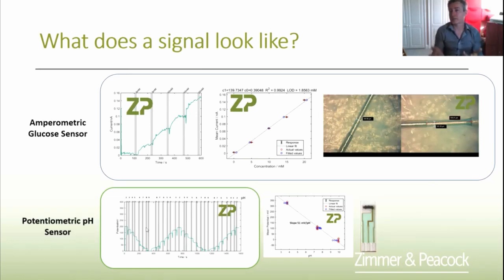So you've got to buffer this system. Otherwise, you can have an enzyme in some sort of unknown pH between 5 and 7. And if that's going on, then you'll have a different signal due to the pH, and it's not specific to the glucose. So we buffer because often pH can be a source of variation in an assay. We don't want that source of variation. So we buffer it to make sure that pH is not a variable. The things that we try to control in biosensing are temperature and pH, at least two of the variables that we try to control.